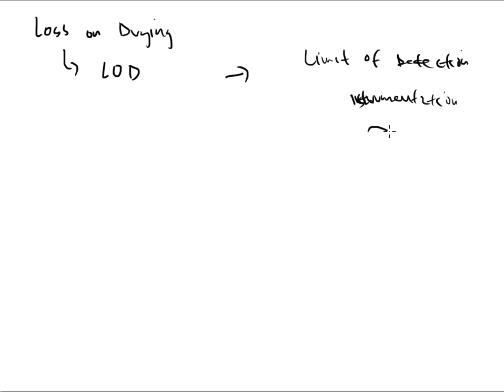And this instrumentation, it can see stuff, folks. It has eyeballs. It can see things that come through the piece of equipment to report those numbers back to you. However, the idea here is like a game of limbo. How low can you go? So limit of detection is another type of test that we use on equipment in a laboratory to figure out how low can we go and still have the instrument report reliable data for us.